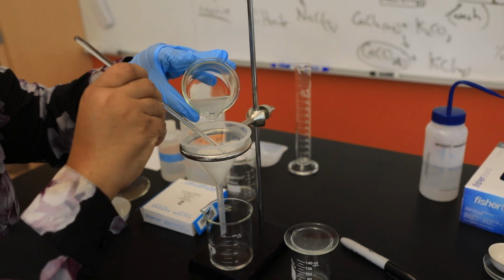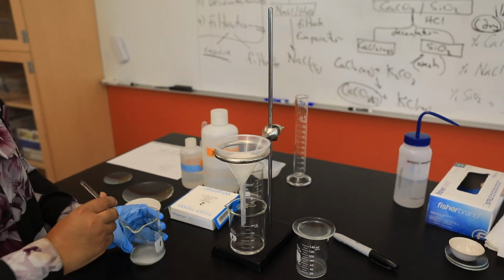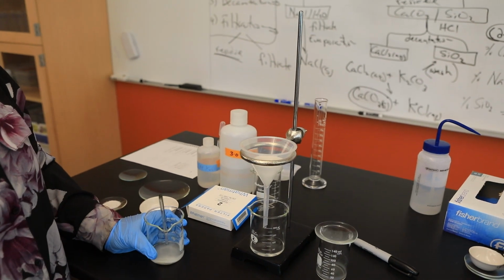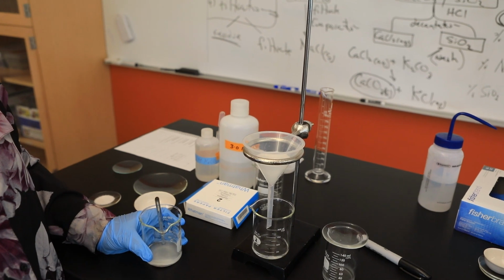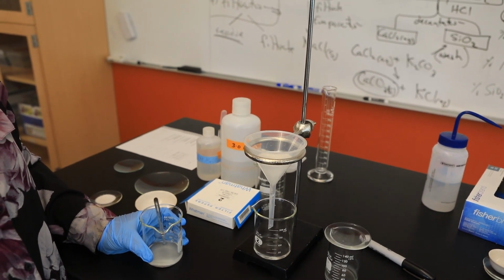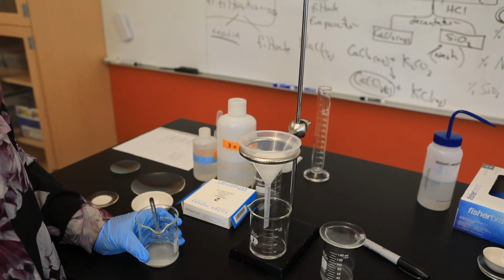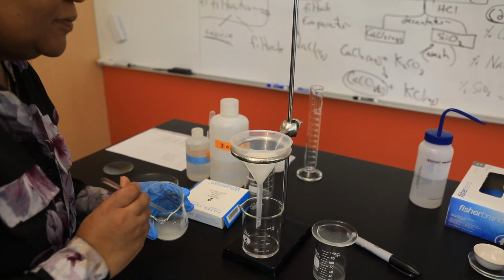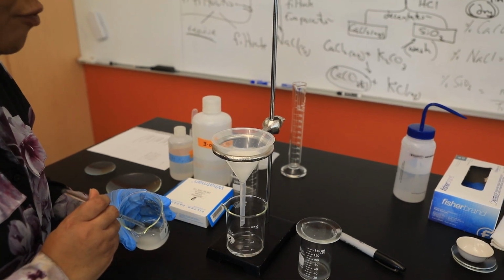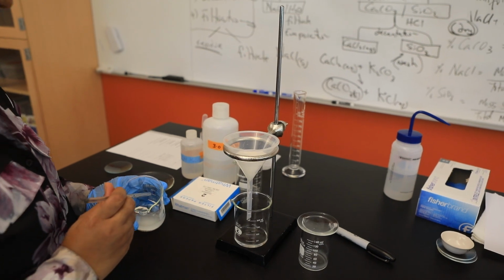And all I'm doing right now is just adding the remainder of my solution to the filtrate setup. Never rush. You just have to be patient as we do these experiments.